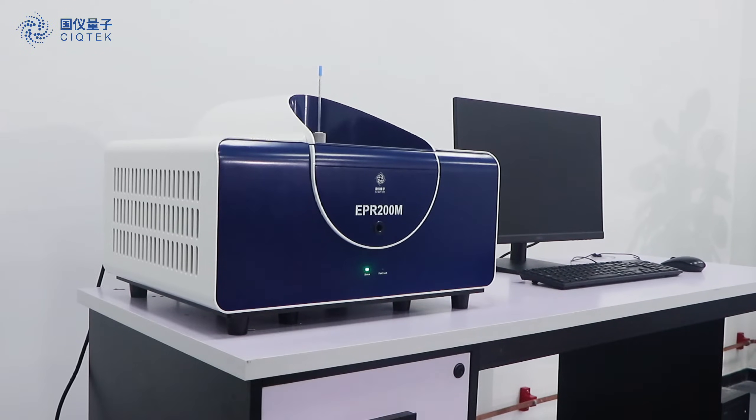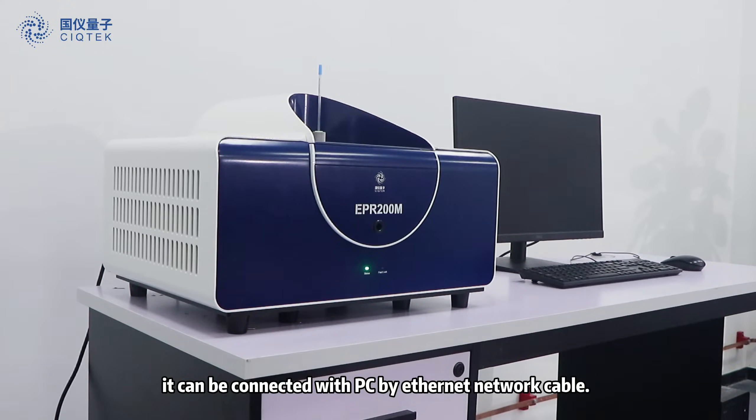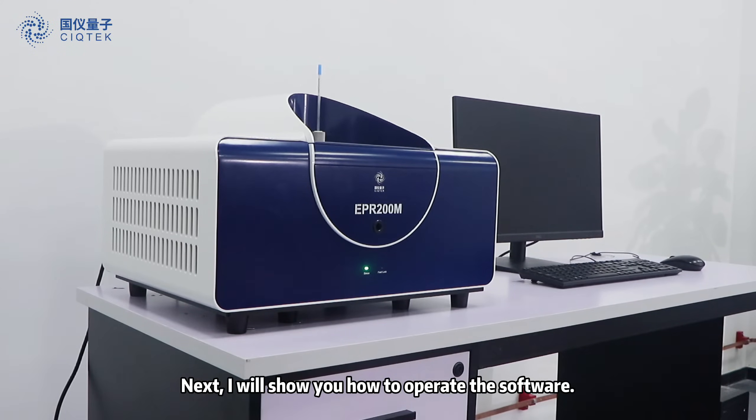For the software operation, it can be connected with a PC by Ethernet network cable. Next, I will show you how to operate the software.